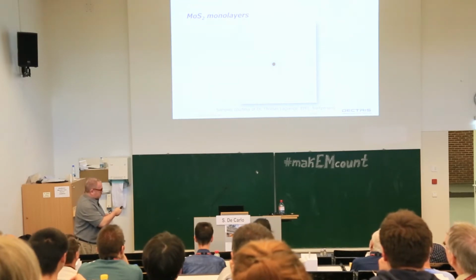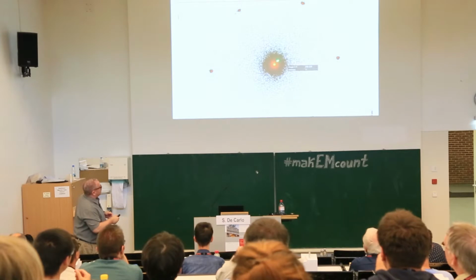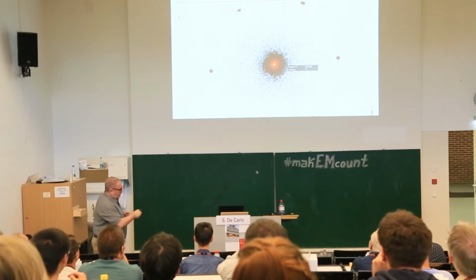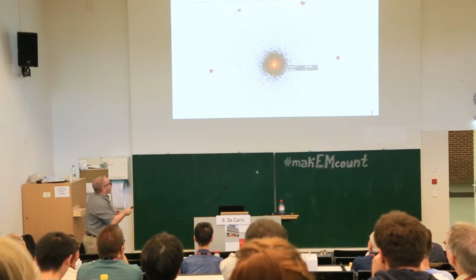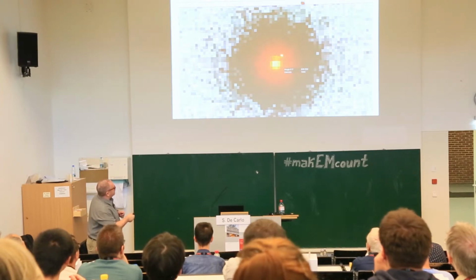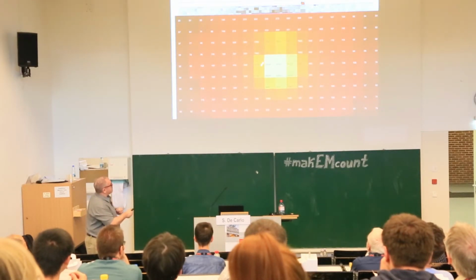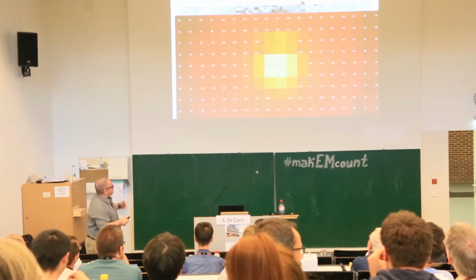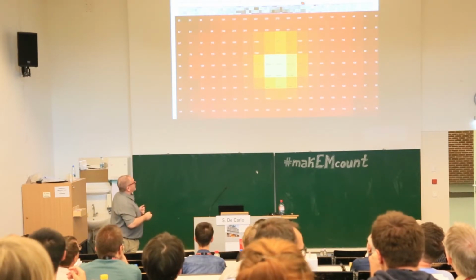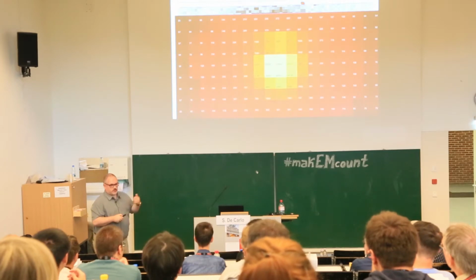As you have a look at the central peak, I'm zooming in now, you can see that thanks to this technology, you can actually have the direct beam, this is 1 frame, and then you have very low counts around the main diffraction beam. I'm zooming in one more time. Unfortunately the cross is no longer visible, but here is the central beam, and these are the neighboring pixels with about 1,000 counts. When you zoom in, this is 1 frame, so the 4 central pixels are saturated, that's the 16-bit beam counts, and then all around you have a very low count. That really increases the quality of the data. If you then sum more than 1 frame, you can extend the dynamic range up to 32-bit.